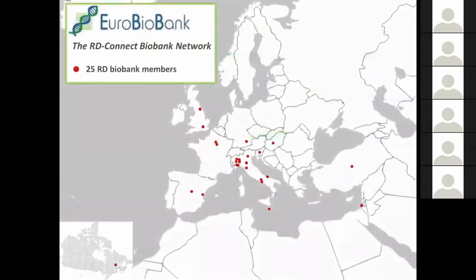This webinar is the second run of the webinar designed for biobank managers. This is dedicated especially for you, biobank managers in the EuroBioBank network. Right now we have 25 rare disease biobanks scattered in 11 countries. So we're looking forward to you getting more and more involved.